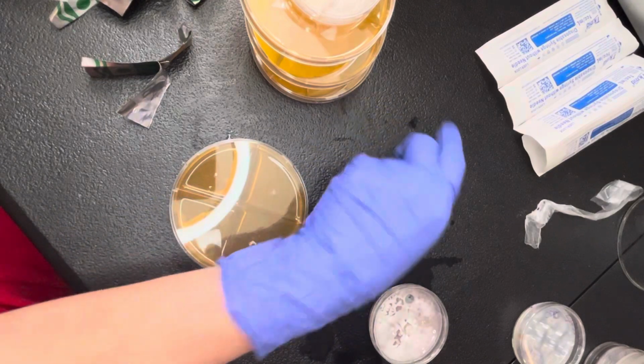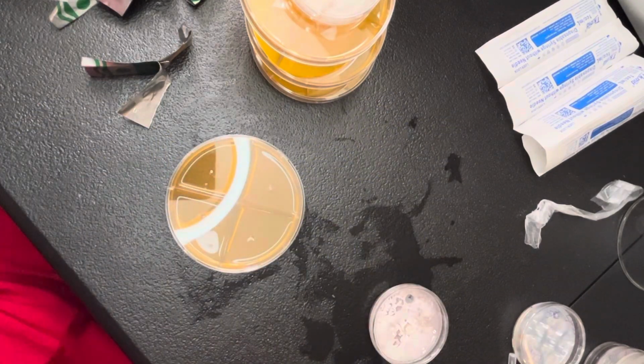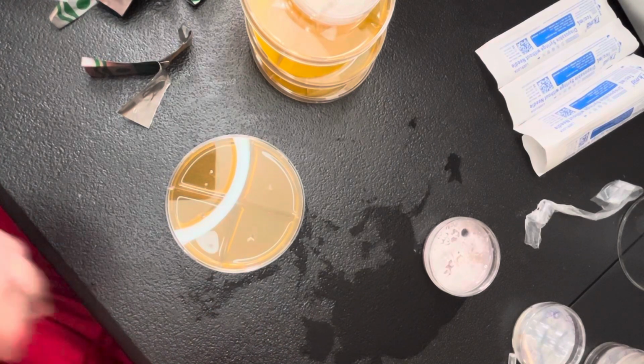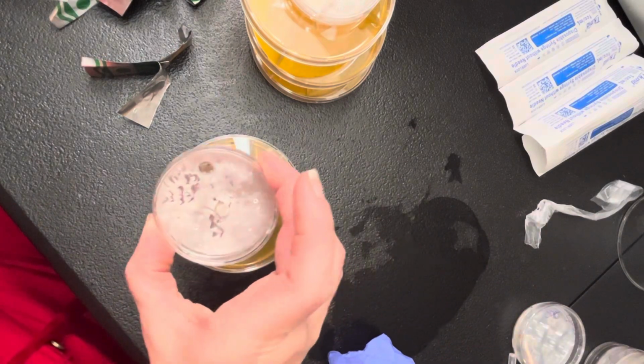So the purpose of doing it this way is that I was able to avoid getting much of the agar on there, and just have mycelium, which is going to give it an opportunity to grow with just the mycelium, without whatever was on the agar. It was looking a little slimy to me.